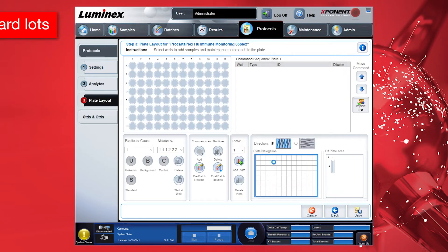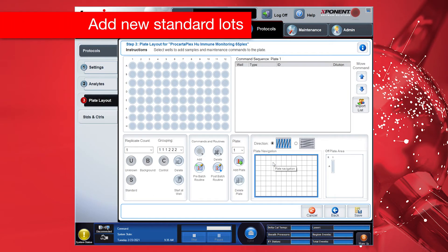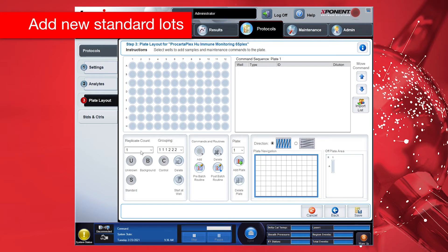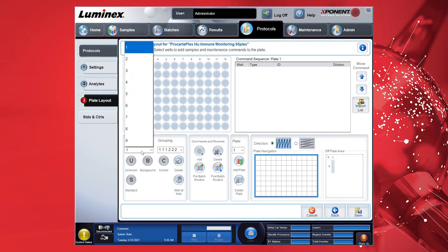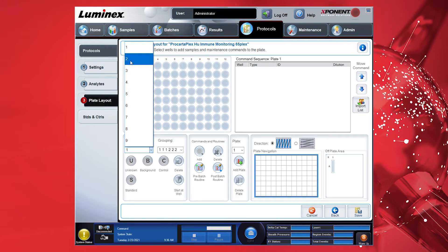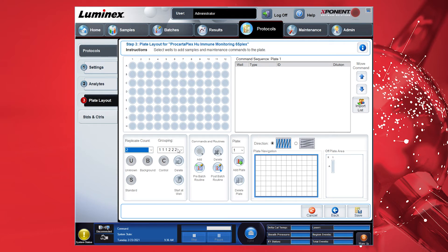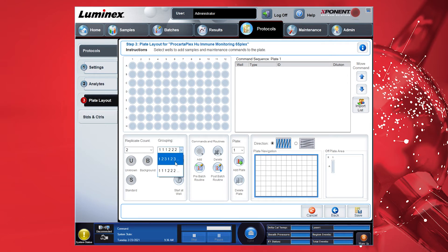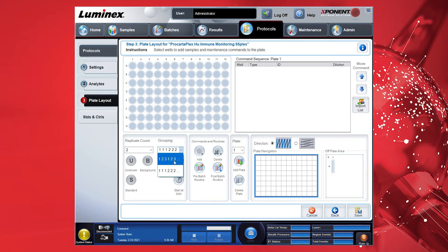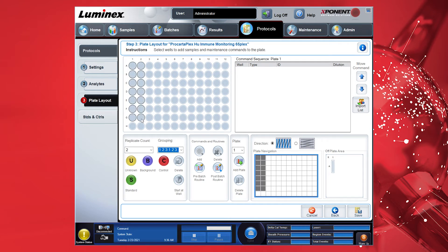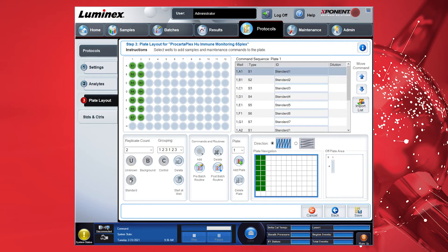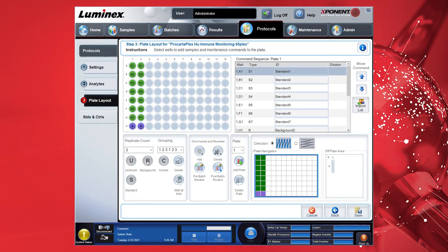In the plate layout, first define how your standards were pipetted. Then define if you have used duplicates or only single values with the replicate count. For duplicates, use 2. Using the grouping drop-down to select the correct setting. For vertical duplicates, use the 1-1-1-2-2-2 setting. For horizontal duplicates, use the 1-2-3-1-2-3 setting. Then choose first the S for standards and mark all the columns you used for the standards. Repeat the procedure for the background wells. Save the protocol by clicking the Save button.